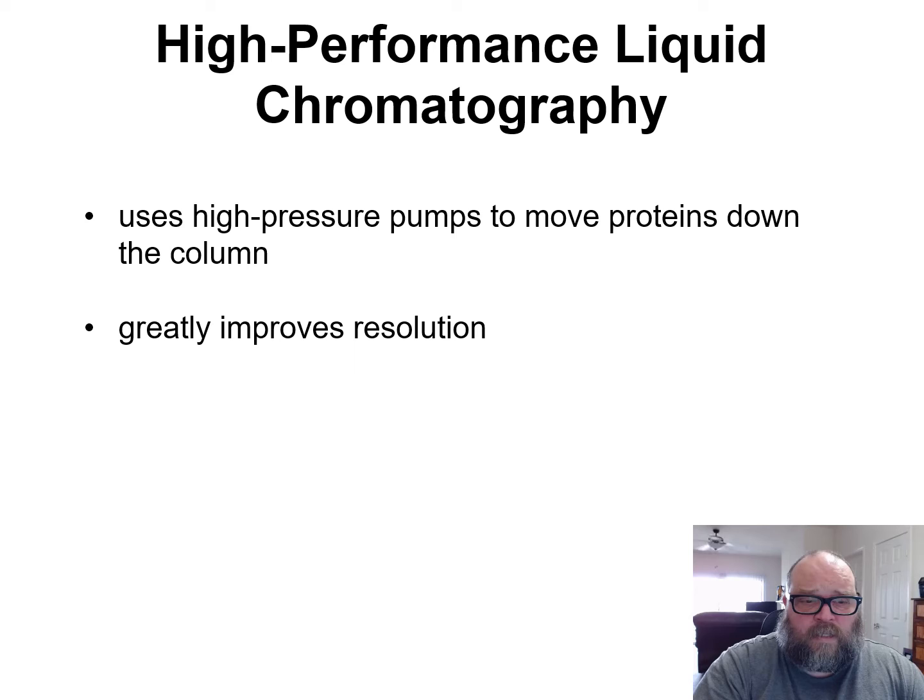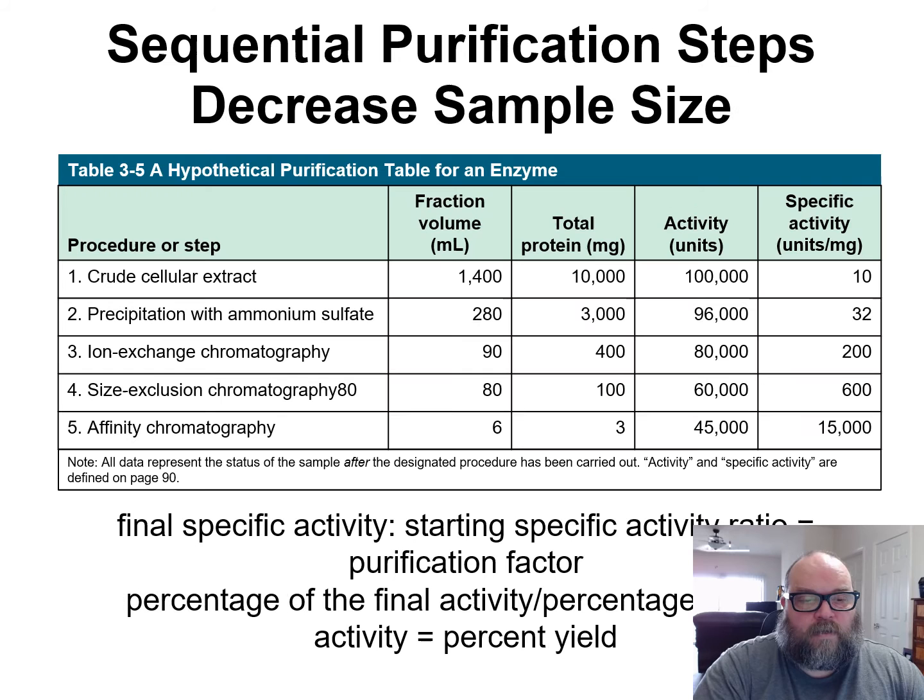And because of this, you can run multiple washes through to remove the extraneous stuff that may have just gotten caught up. And you can still do it within minutes as opposed to the half an hour to an hour the old way used to take. And that's without all the washes and all the other things.